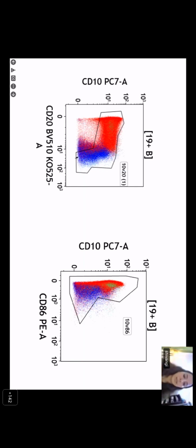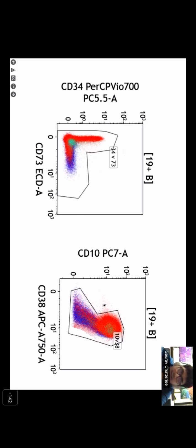Yes, sir. There's a maturity pattern that's showing. It looks like these cells are maturing towards mature B cells. I can see a nice maturational pattern. Now, some other markers we did, like CD86, even CD73. I think these are some aberrant markers. They usually come in B lymphoid blasts, but they are always negative on hematogones. So those markers seem to be negative, right?